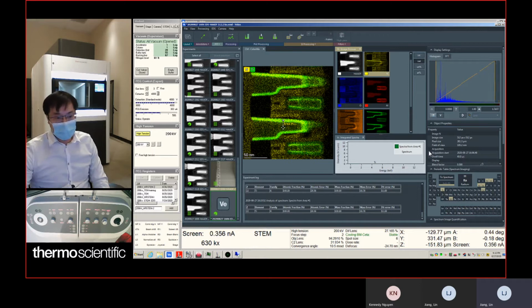Okay, so you see the fitting angle together. I think it's done.